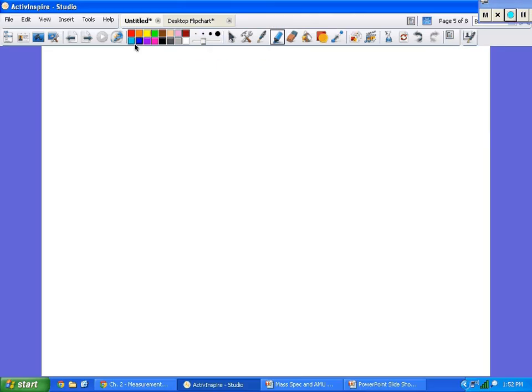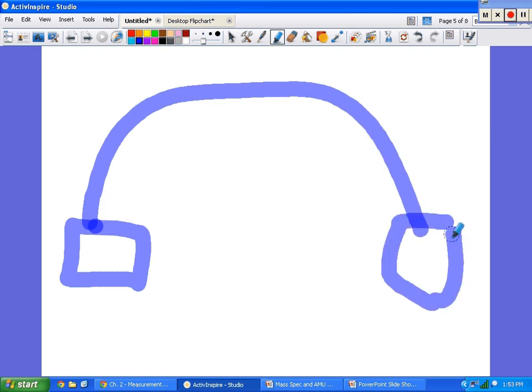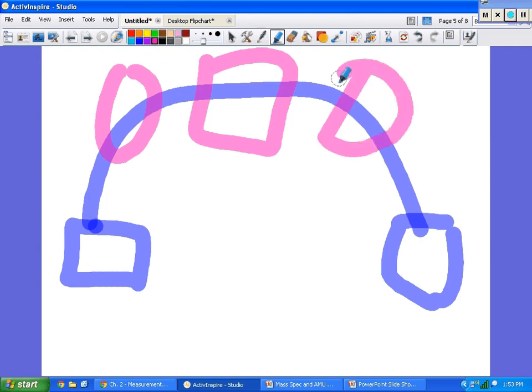Okay? You've got the sample here, and you've got the tube that comes out. You've got the receptor plate here, and you have the magnetic field here, here, and here. So there are 2 places that it could hit. If it's traveling, it could hit this outer wall, or it could hit this inner wall. So it's basically making it be perfect to get to the final. Like if it was a particle, it's got to be perfect to make it through.